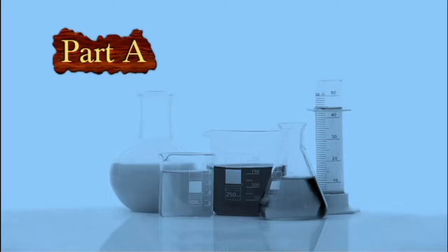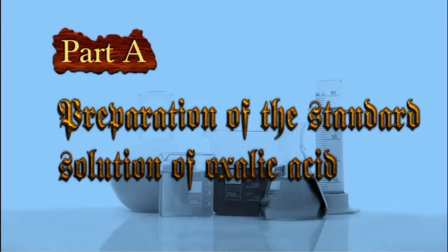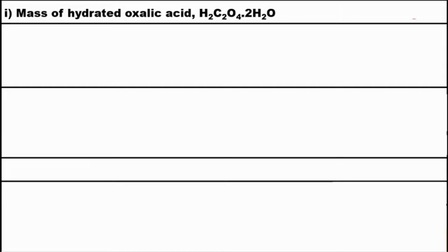Part A, preparation of the standard solution of oxalic acid. Remember the one that you have prepared in the 250 ml volumetric flask. In this first part, firstly you weighed the mass of hydrated oxalic acid. As stated in the manual, you should weigh how many grams? Yes, 3 grams. Let's say this was the mass of the hydrated oxalic acid weighed, 3 grams.